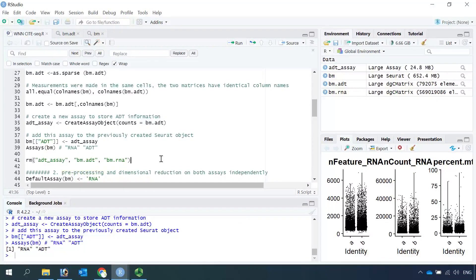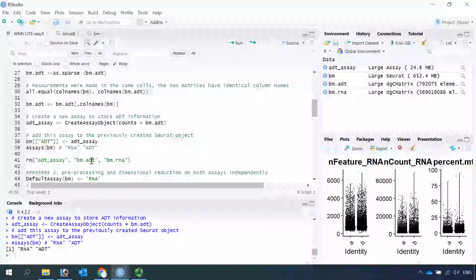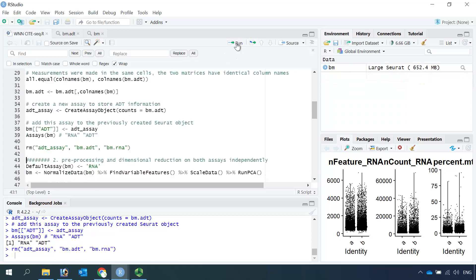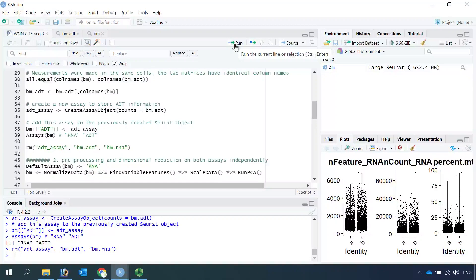If we check the assays in the Seurat object again, you can see we now have both the RNA and ADT assays. From here we only need the Seurat object, so we can remove the data frames we no longer need. In summary: we loaded the data into R, performed quality control, and the Seurat object now contains both RNA and ADT assays.